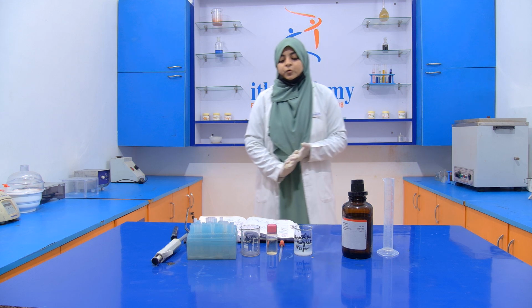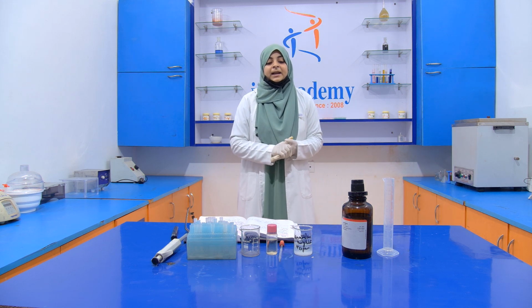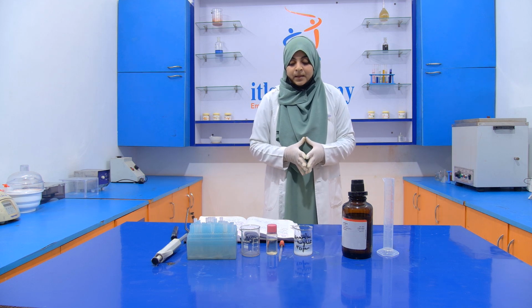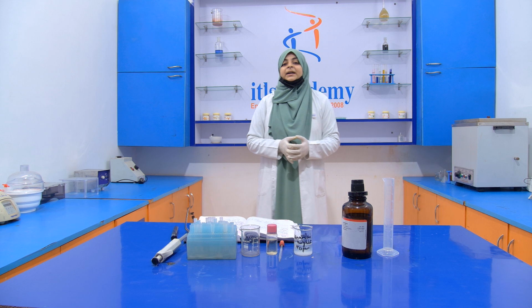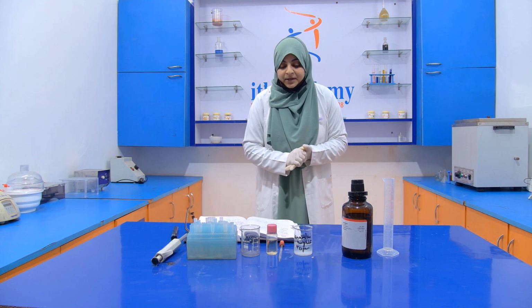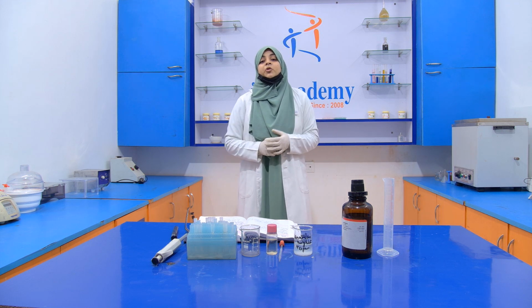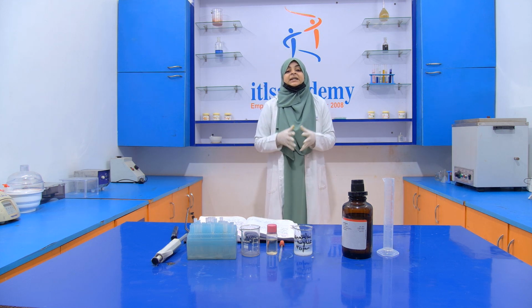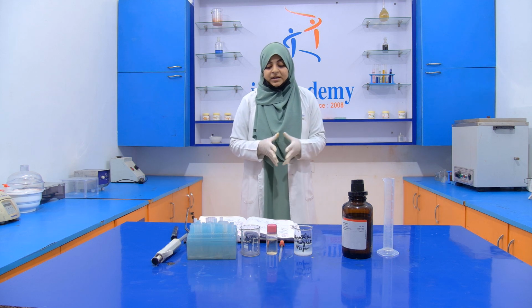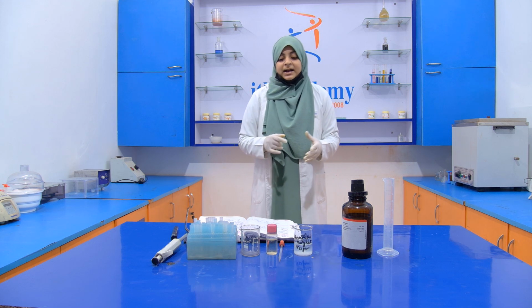Now what we have to do is take 1 ml of oil into a beaker and add 10 ml of petroleum ether. Then we mix it properly by shaking it. Then we add 1 to 2 drops of this ammonium molybdate reagent, and if castor oil is present, then instant turbidity appears, which indicates the presence of castor oil in the edible oil. Now let's start the experiment.